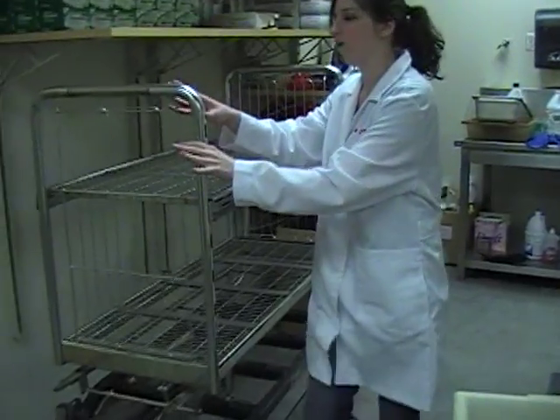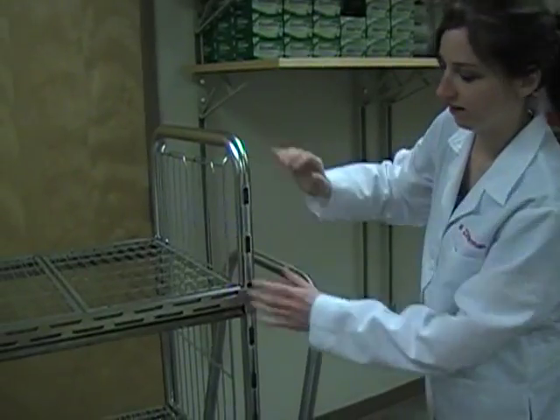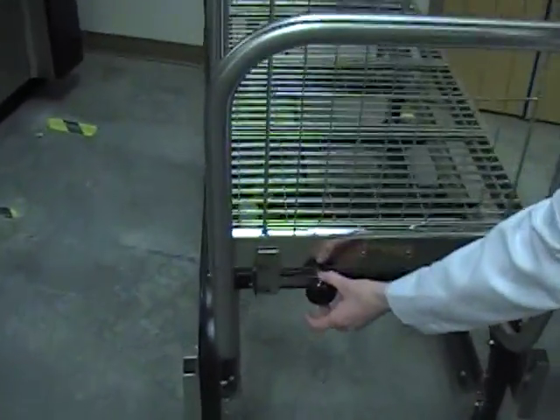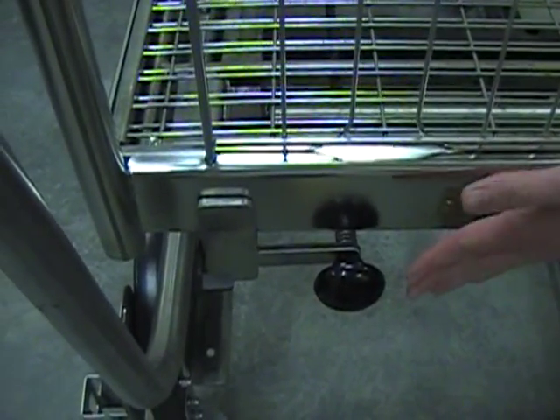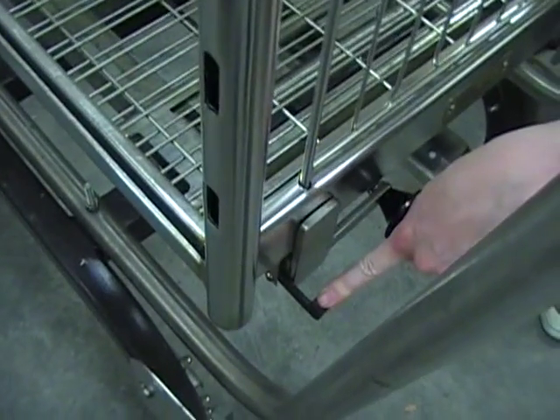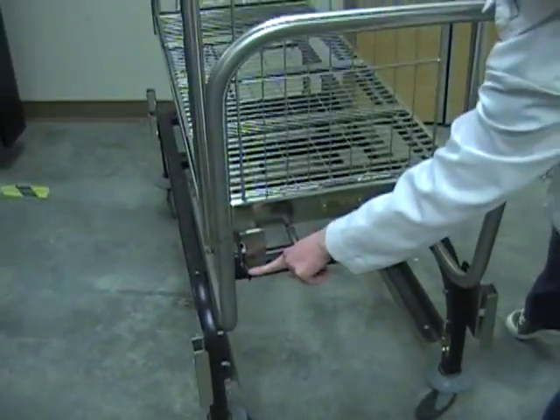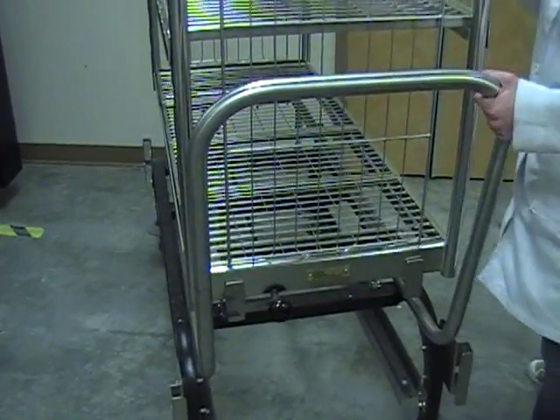There are two parts to this cart: the rack and the actual cart. On the cart there are two handles. There is the inner handle, which you pull back on to release the cart from the autoclave. The outside handle is to release the cart from the rack. I'll show you how to use the outer handle and inner handle soon enough.